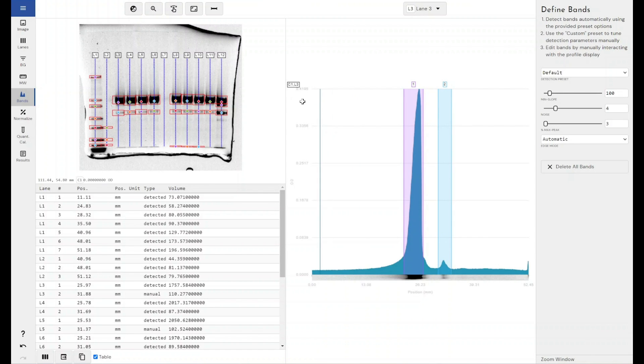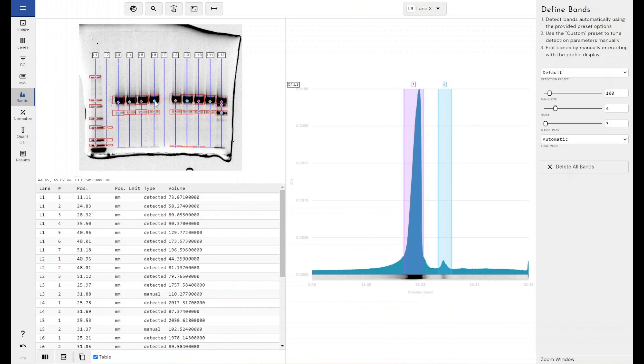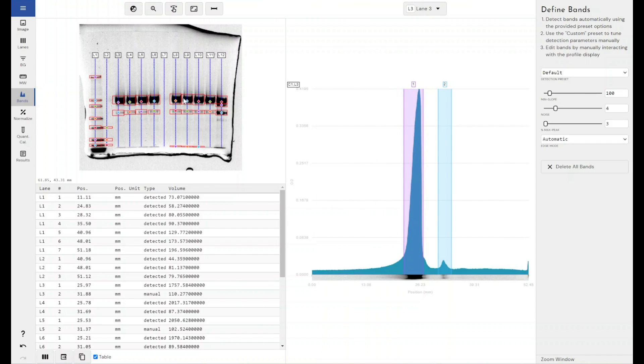So now I've detected my bands. These diamonds in the center of the band is where the software detects the section of greatest intensity within the band. And what this really means is the peak of the band. So this diamond here is where our measurements are taken from for our RF value.